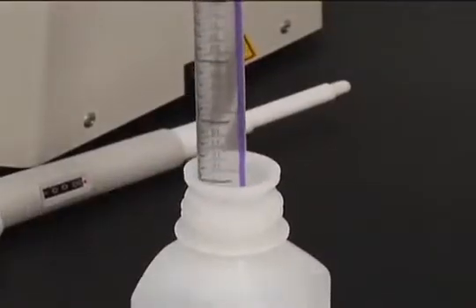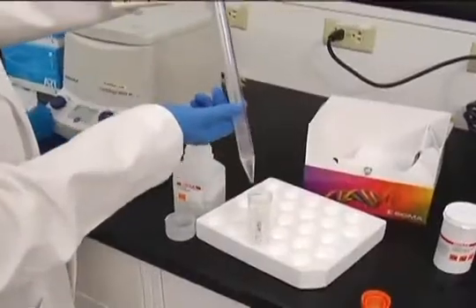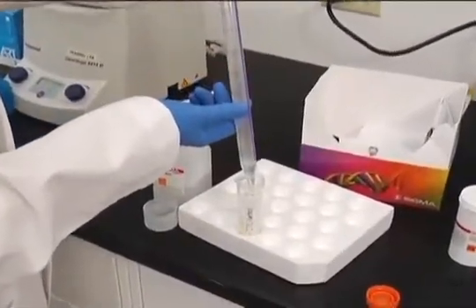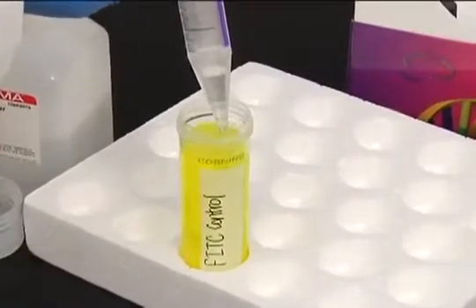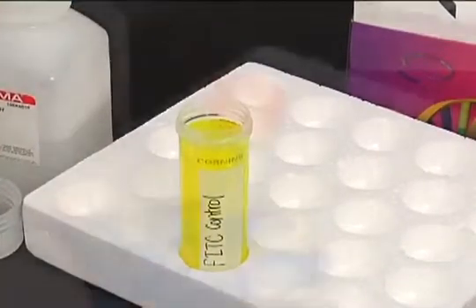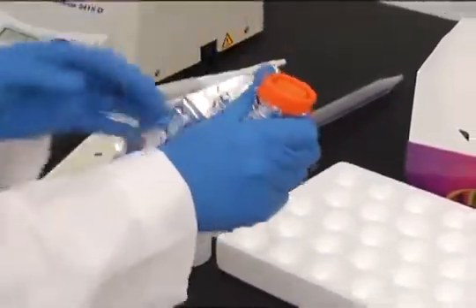If calibrating the fluorimeter or determining the linear range for the FITC signal, prepare the FITC control solution. Make the solution fresh by reconstituting in assay buffer to the appropriate concentration. Once ready, protect the solution from light.